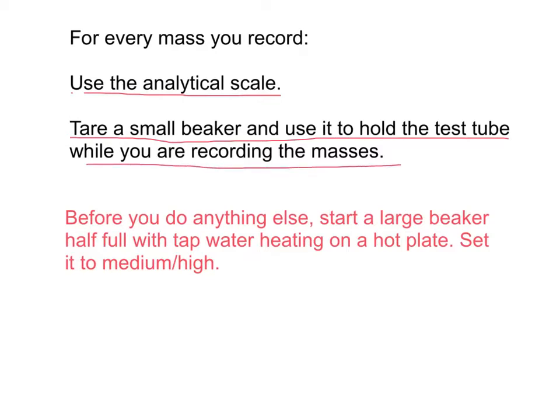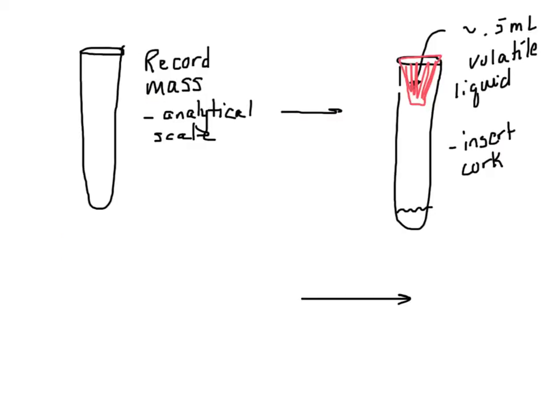and just leave it there for the next person. Before you do anything else, I suggest that you start a large beaker about half full with tap water, heating on a hot plate. You're going to need that, and it'll be better if it's getting hot while you're working on other things. You can set it to medium or high.